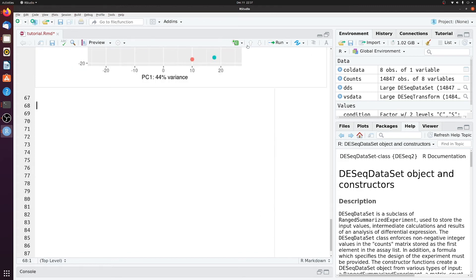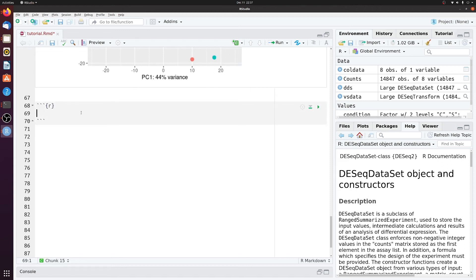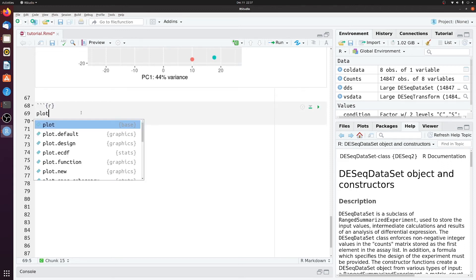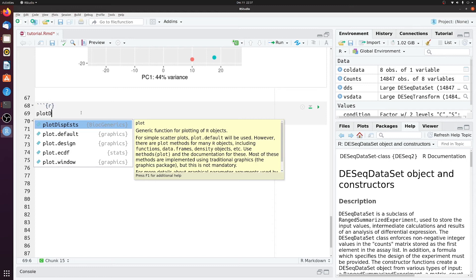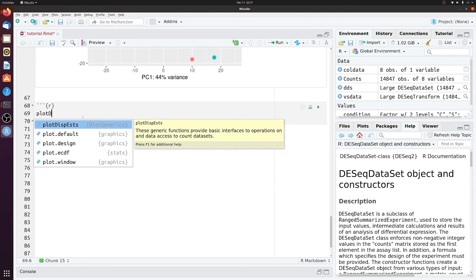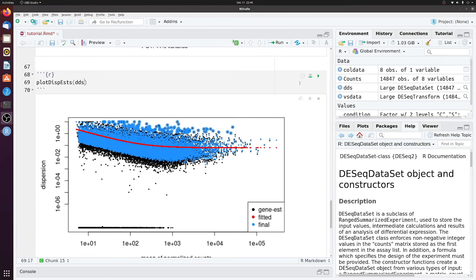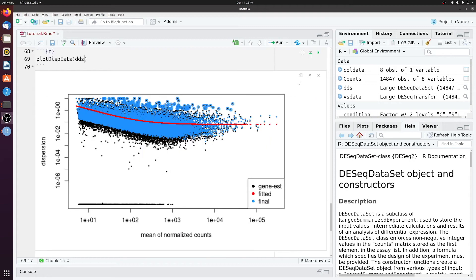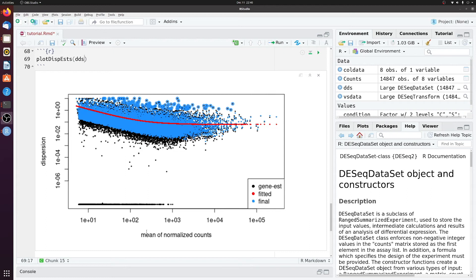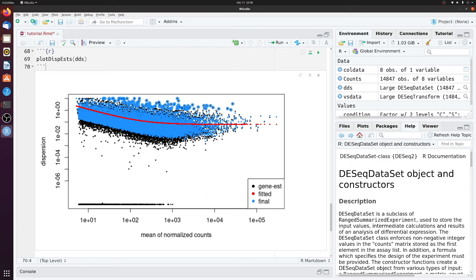Next, we can look at the dispersion of the data. So let's do a plot dispersion estimate here of dds. So I won't go too much into the details here, but basically what this plot is showing you is the dispersion of your data, so the variability between replicates as a function of normalized read counts. So as the read count gets higher, usually there's less variation. So you see a decreasing slope.